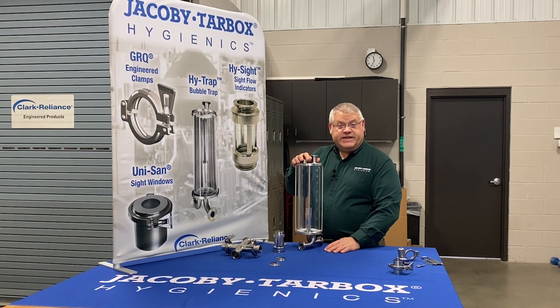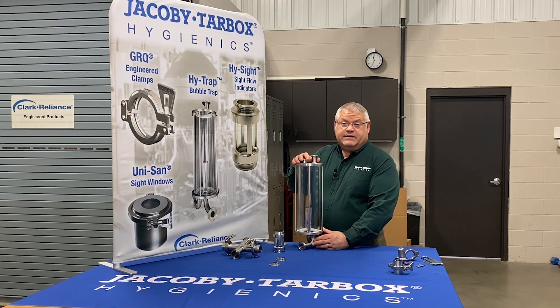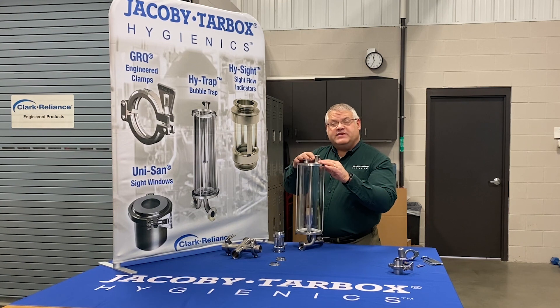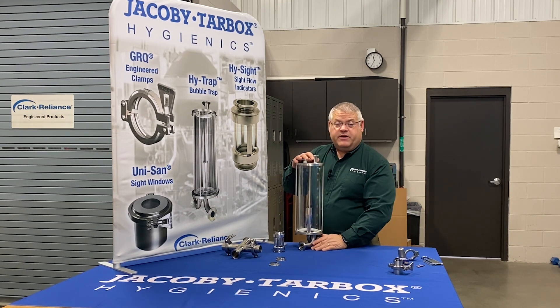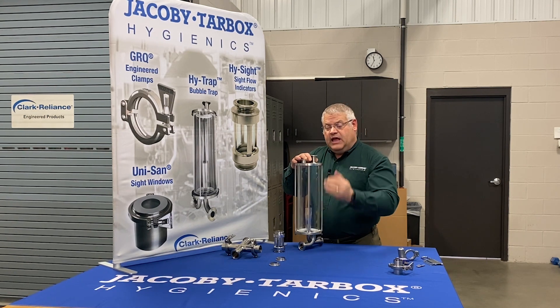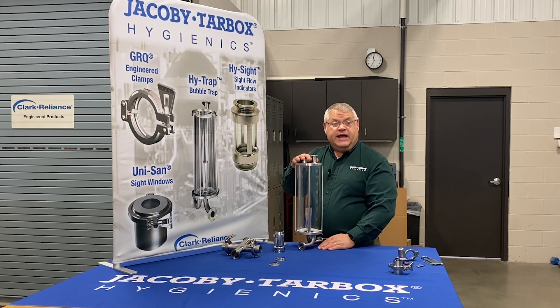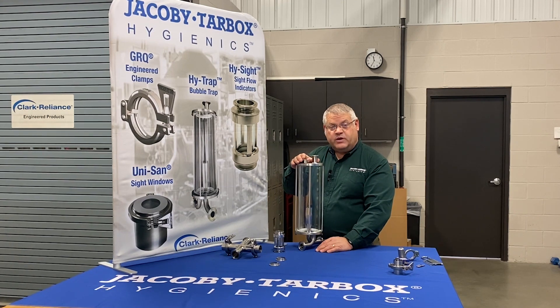Adding additional instrumentation is also very easy on the Hi-Trap. You could add a guided wave radar, for example, including a tee so that you can have a vent out the side and mount a guided wave radar straight through the device. This is a common variation we see from many customers to minimize the number of connections on the Hi-Trap while providing maximum flexibility. The guided wave radar can be added aftermarket or sourced from Jacoby Tarbox Hygienics as well.